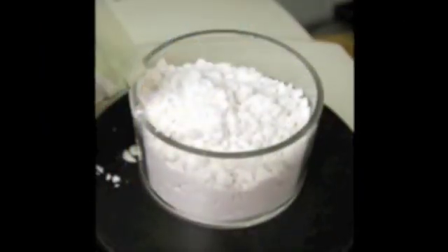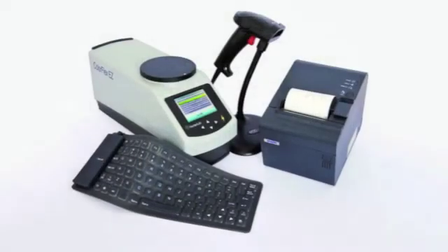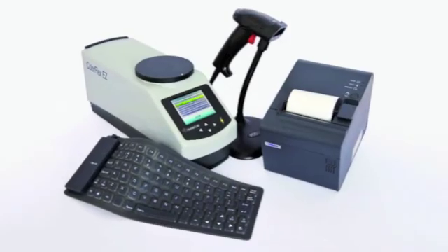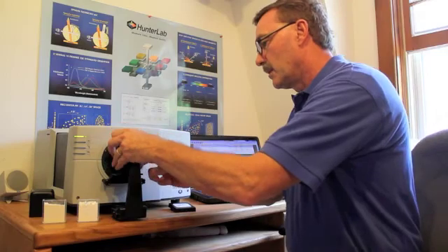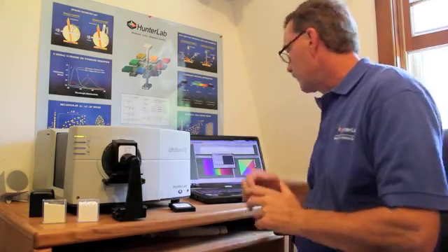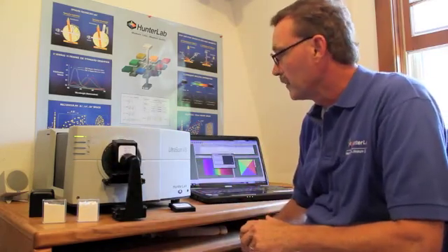The beauty of the benchtop systems is that they maintain the perfect balance between sample measurement precision and versatility. Northeastern U.S. Sales Representative Ken Wendt will now demonstrate how to use the Ultrascan VIS, a visible range, high performance benchtop system.